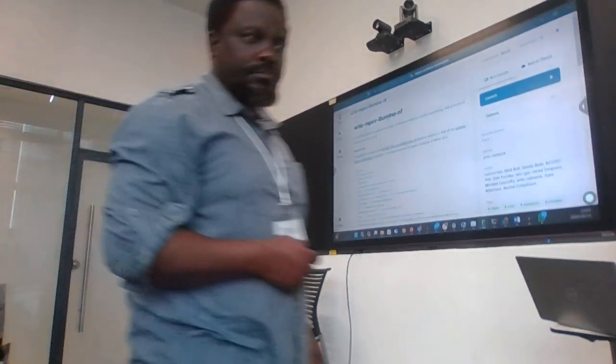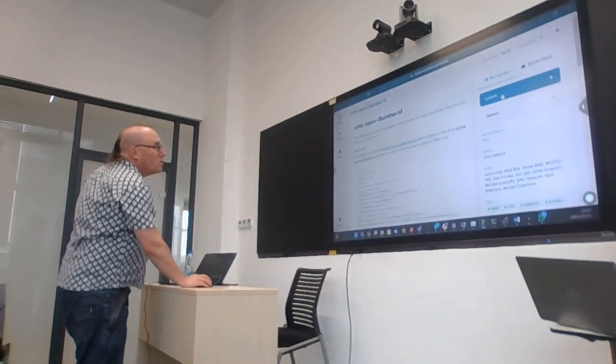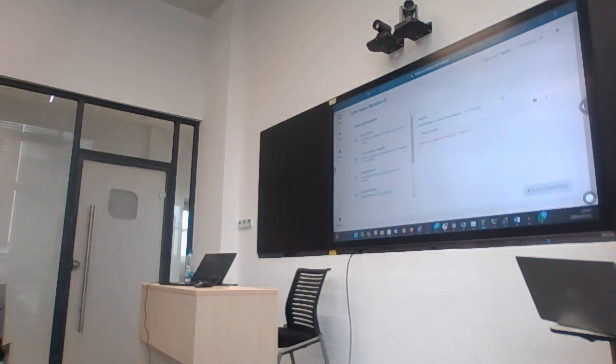Then you click the button which says launch. Then you see this. After clicking launch, you see this, right? I want to go slowly so that everybody keeps up with me. Okay? Is it going? Yes?